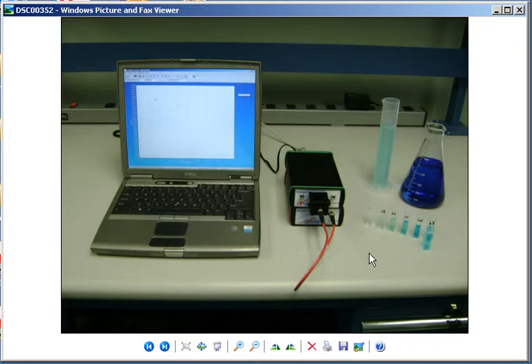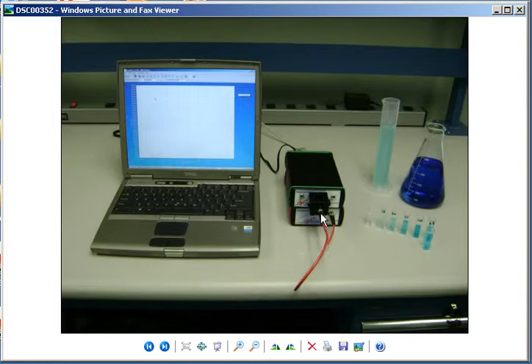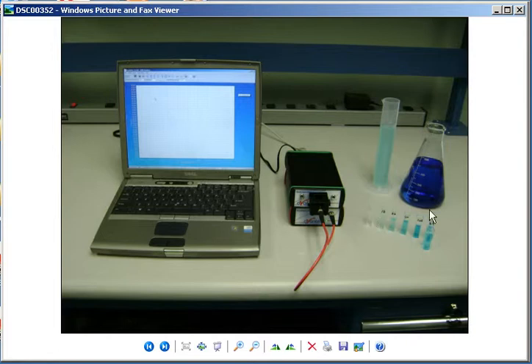The purpose of this video is to demonstrate Avant's AvaSpec spectrometers, light sources, and fiber optic accessories for a chemometry or absorbance experiment. The materials we will need include a laptop or desktop computer running AvaSoft software, an AvaSpec spectrometer with a fiber optic cable connected into a cuvette cell holder containing a one centimeter cuvette cell, an Avalite DHC deuterium halogen light source, and methyl blue solution diluted into various concentrations as well as an unknown concentration.